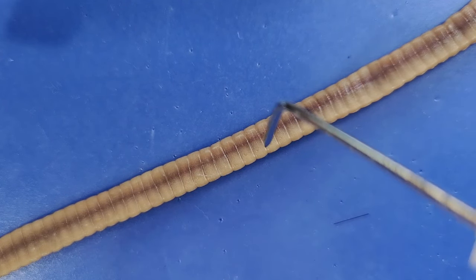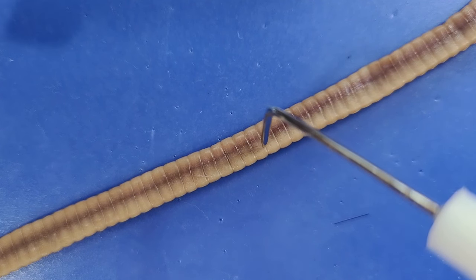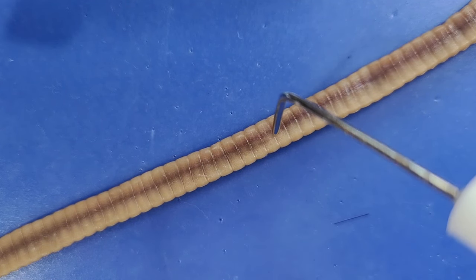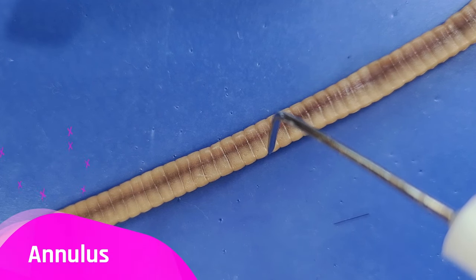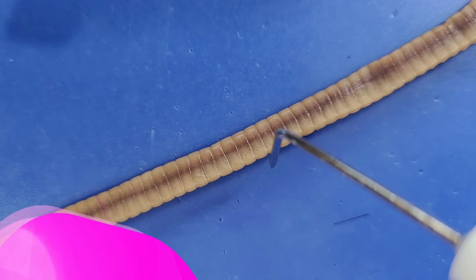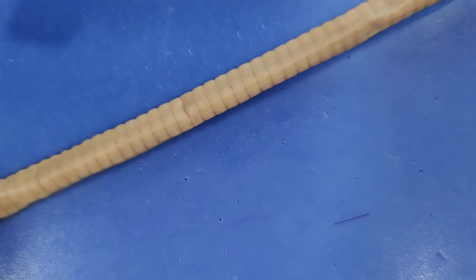You can see these segments — here's one segment, there's another one here, and another one here. These segments are called annuli. Each annulus is covered with tiny hairs called setae on the underside, which helps the worm move.